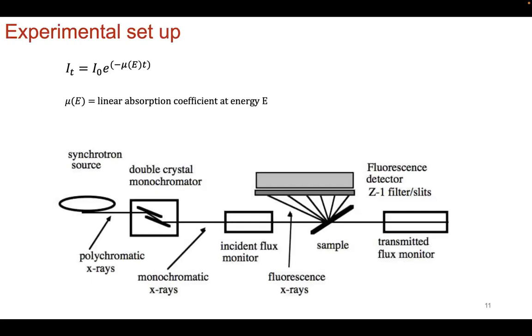Okay. So in terms of the operation of X-ray absorption near-edge structure spectroscopy, it is essentially what you think it is, right? You have an incoming X-ray beam that you've made monochromatic because you have filters and crystals in place from the synchrotron source. You have it coming in, and you could do one of two experiments. You can measure the fluorescence that comes out, so if you have low concentrations, you could do fluorescence. You could also do transmission and measure the transmitted beam here.